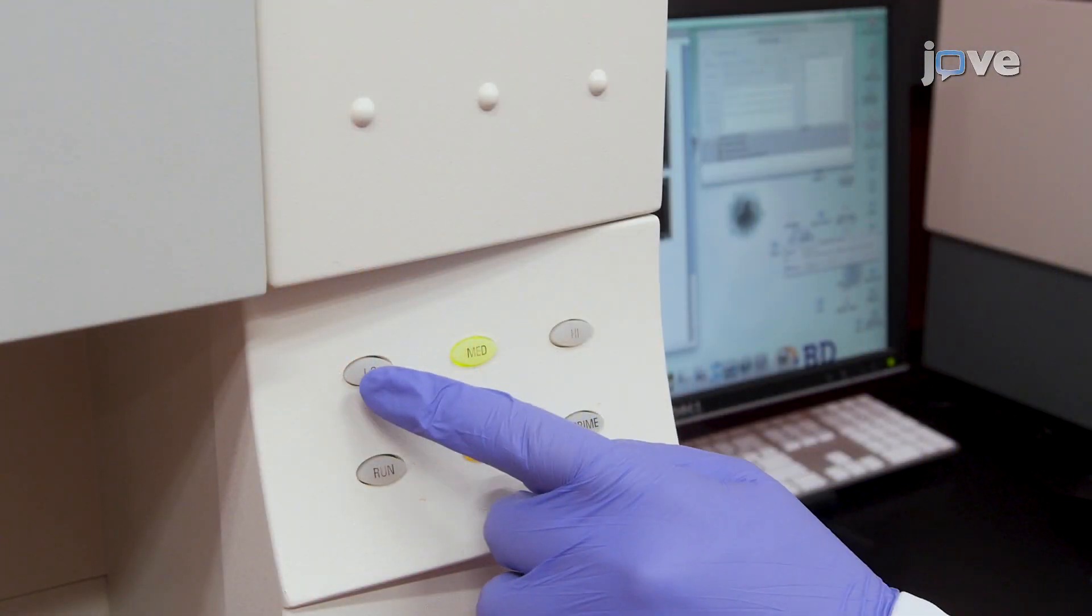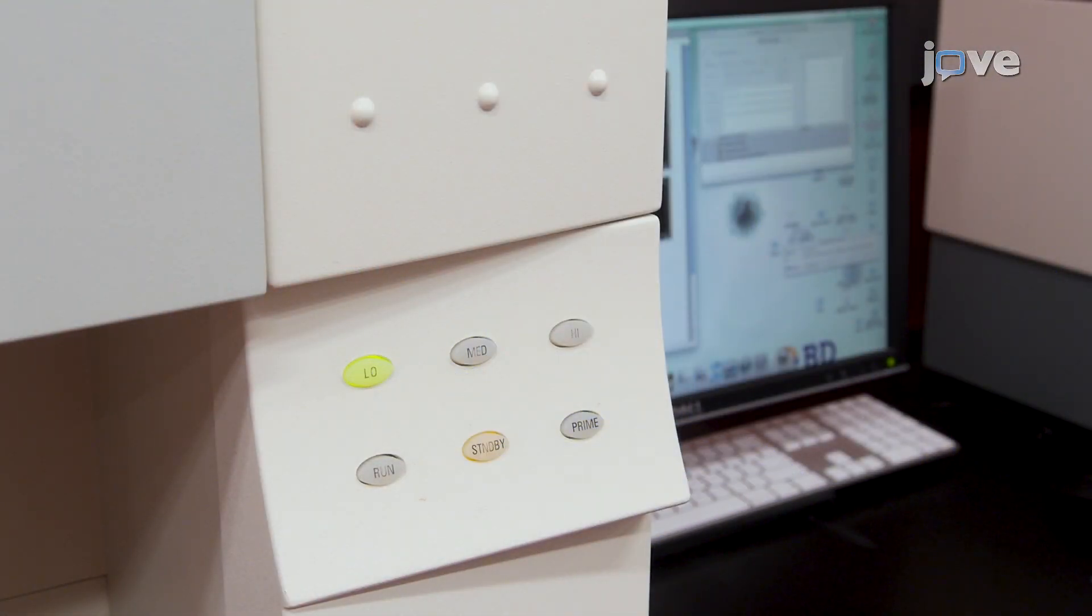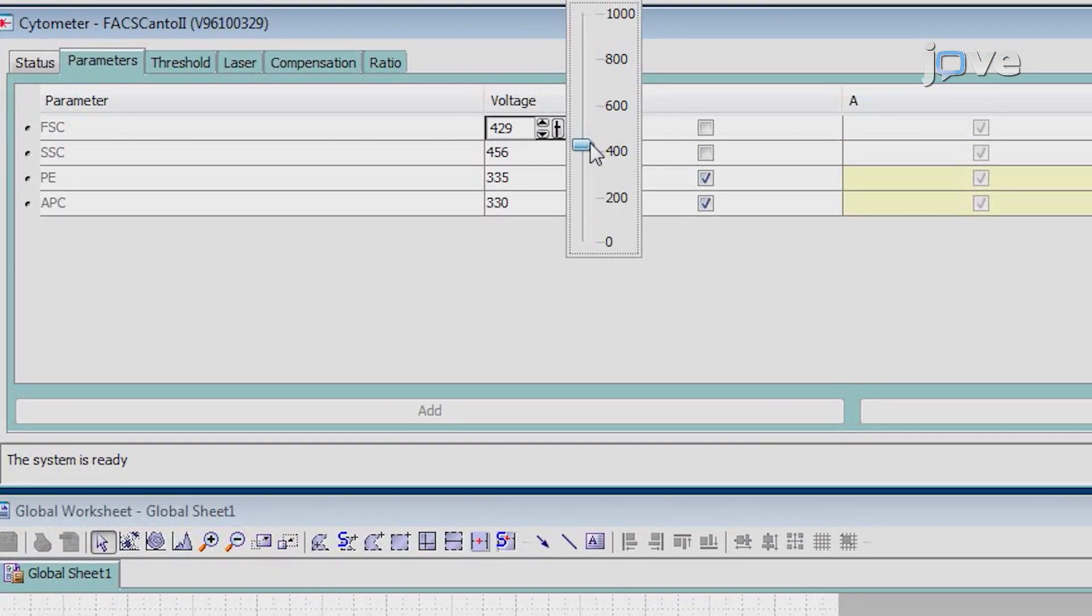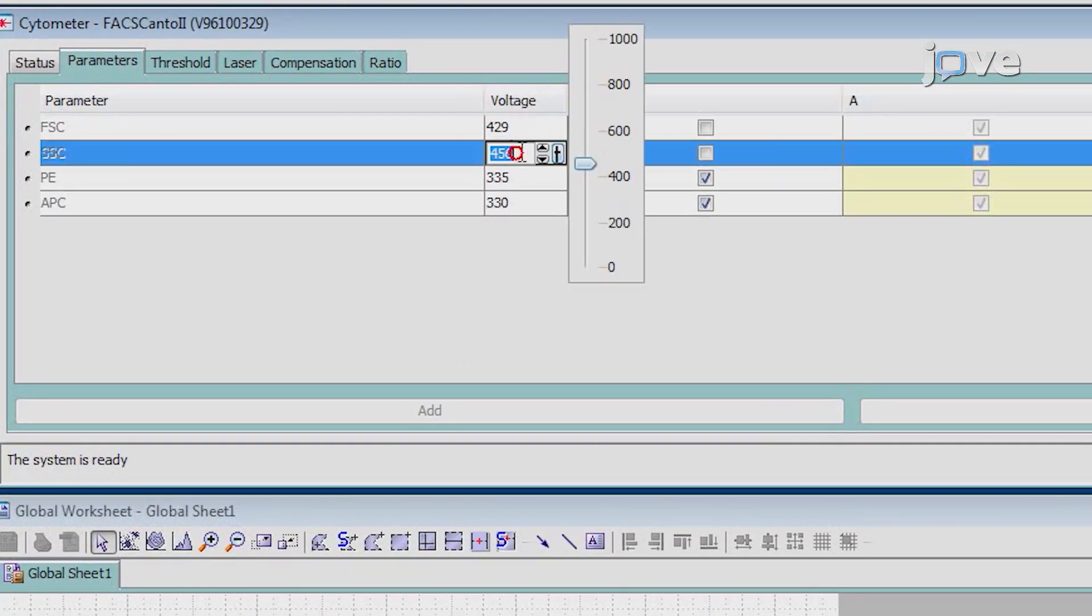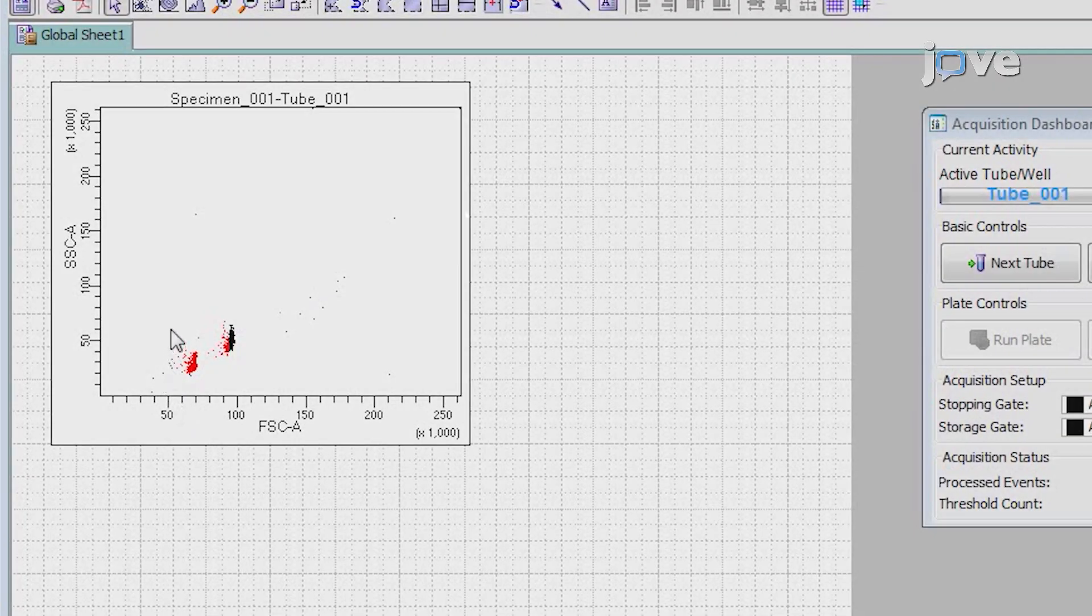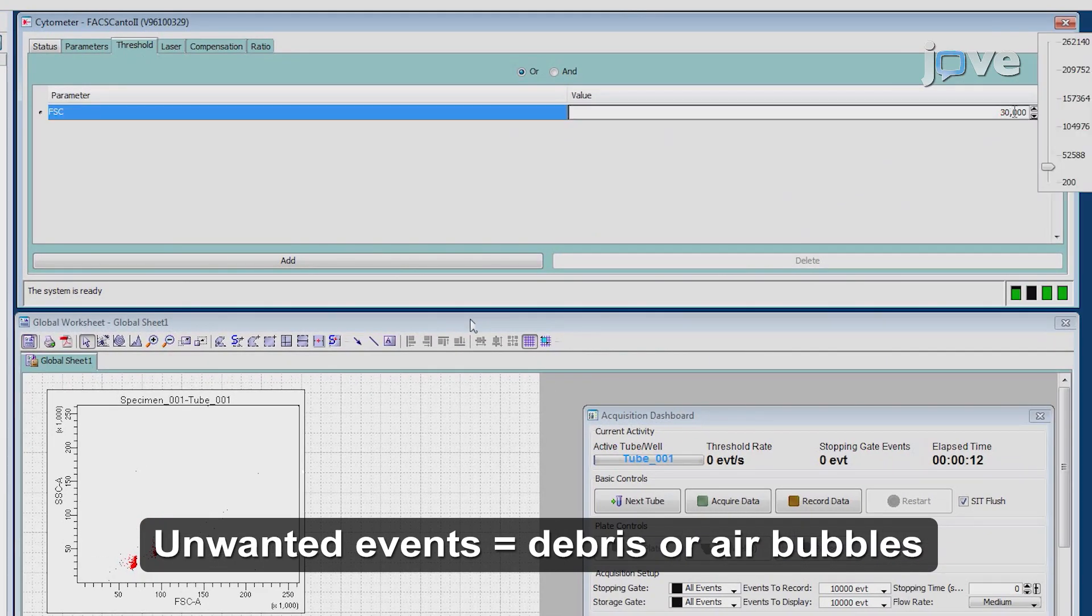Set the flow cytometer flow rate to low. Run the raw beads, carefully adjusting the gain and voltage for forward scatter and side scatter so that both size populations of these beads are visibly separated and easy to gate. Adjust the forward scatter threshold to exclude unwanted events.